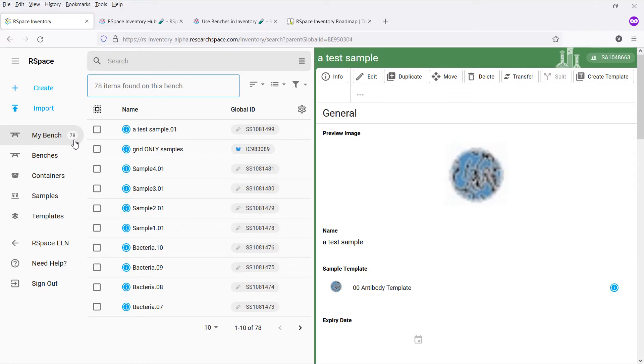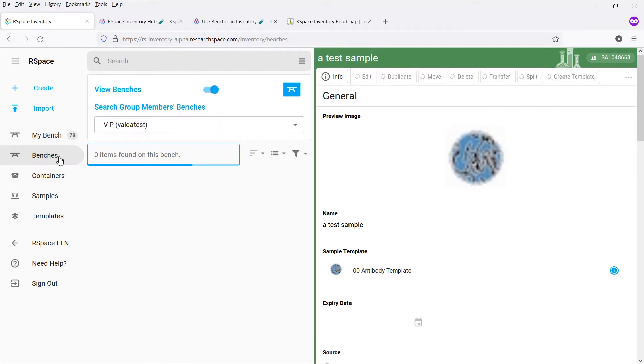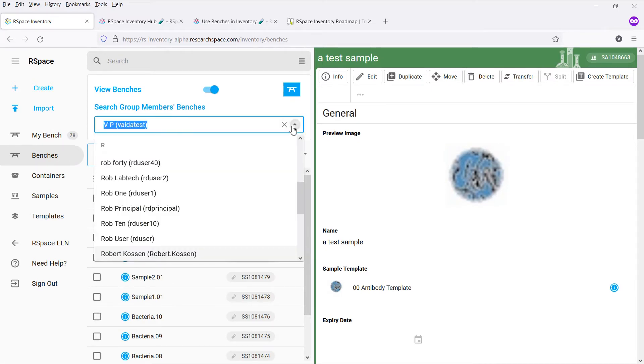By default, all the new subsamples and containers you create or import will be placed onto your bench. By clicking the bench's sidebar link, you can browse the benches of users in the same lab group as you. Simply type in or use the drop-down to select the user you want to view the bench of.